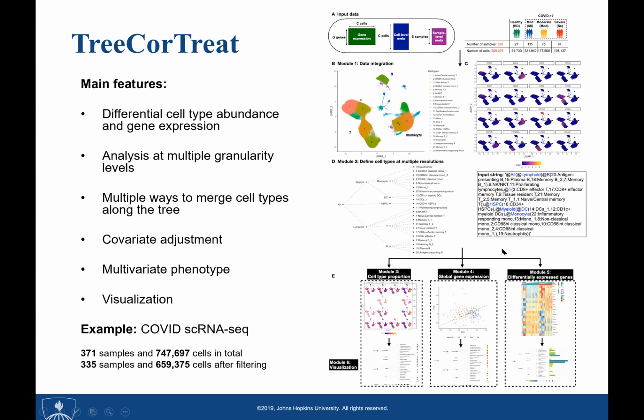Right? So therefore, when you do this differential gene expression analysis, you have to go back to the original gene expression values. And you only use this integration to specify which cell type it is. And then once you go back to the original gene expression values, you are going back to the batch effect correction problem as you have in the traditional bulk RNA-seq data.